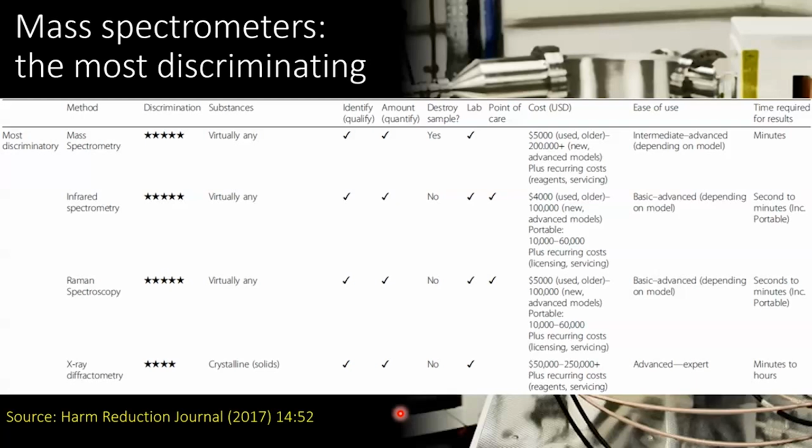Last one's kind of interesting. So X-ray diffractometry, I would argue if we're talking about single crystal X-ray diffractometry, that is the best, most discriminatory technique out there because that will literally give you a model of your unknown sample. Now, it does have a fairly large limitation in that it can only analyse crystalline samples, but that said, it is probably the most unambiguous of all 4 of those techniques in terms of telling you what your sample is.